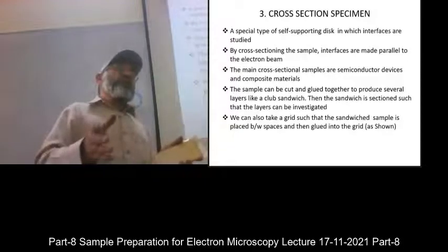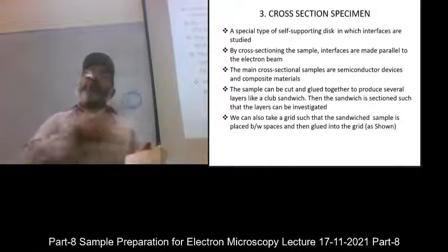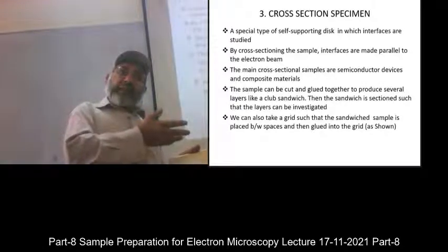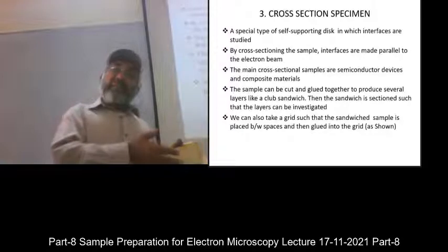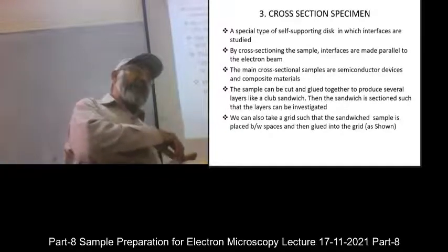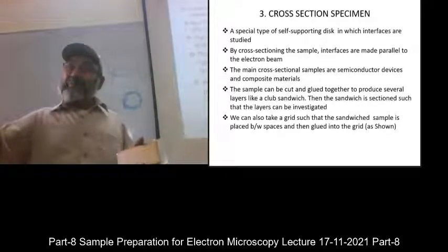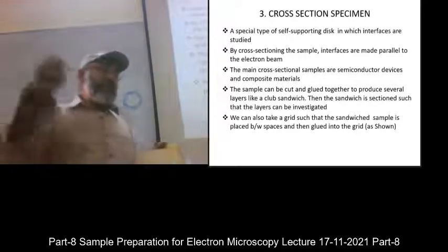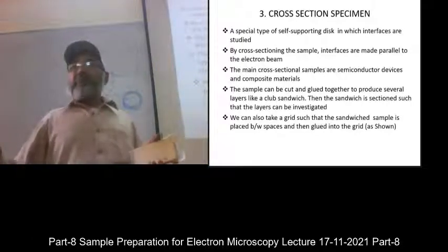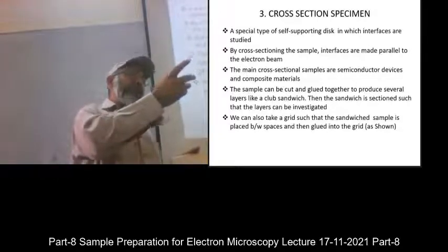For example, how a sodium ion went into a lithium silicate structure, right? Did it become part of that structure or did it precipitate separately? If it precipitated separately and had another property for being separate, then that property will be visible.